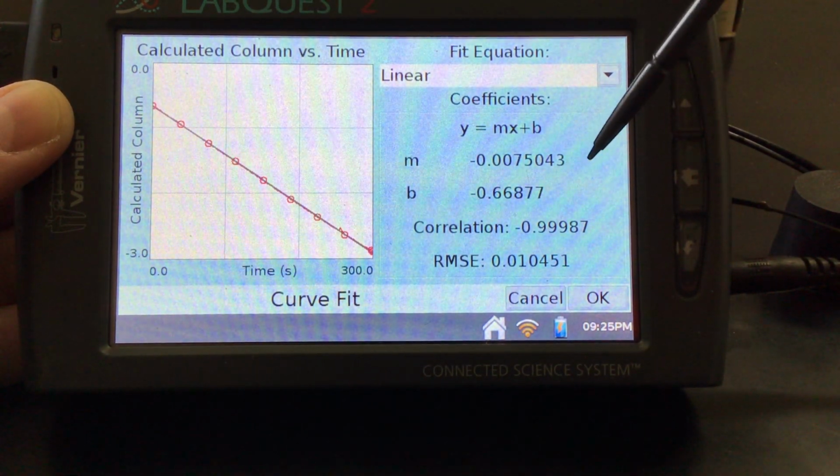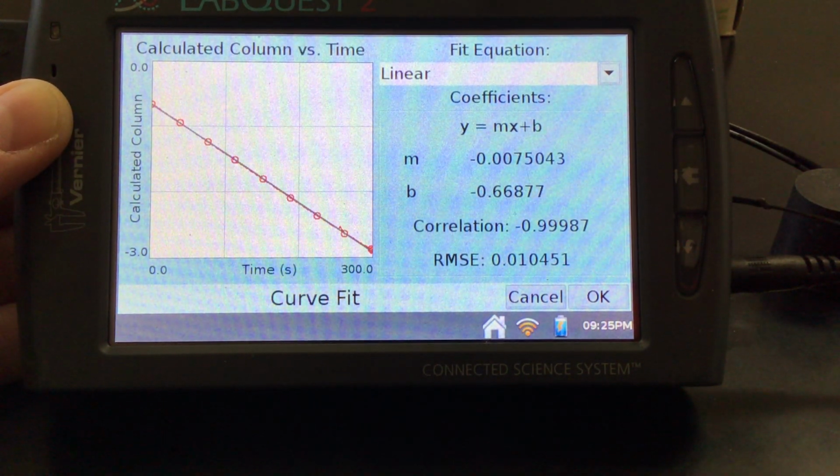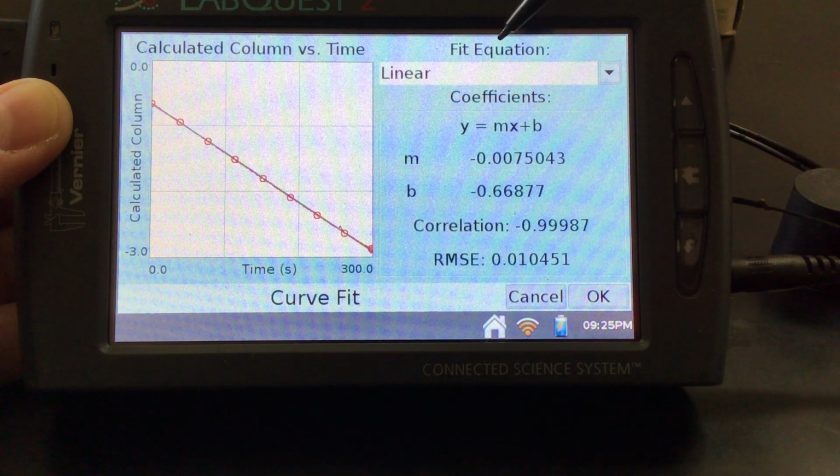So that's how you create your calculated columns. You're going to be using that for your crystal violet lab and some other ones, and it's pretty slick.